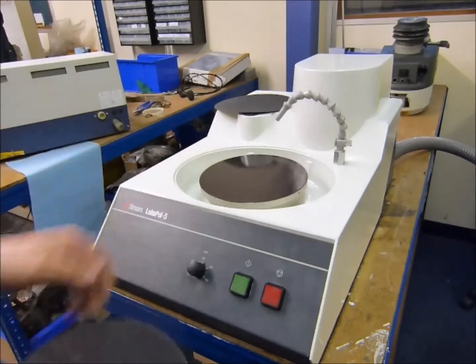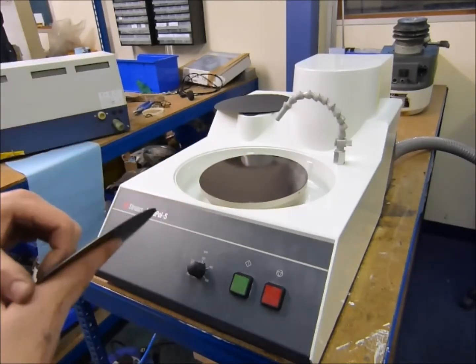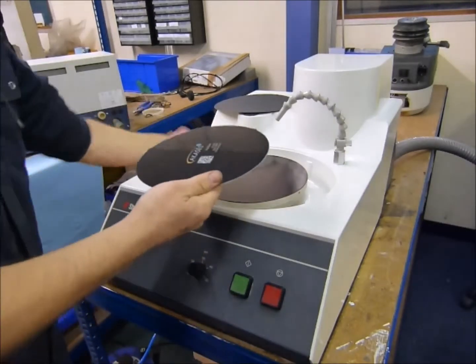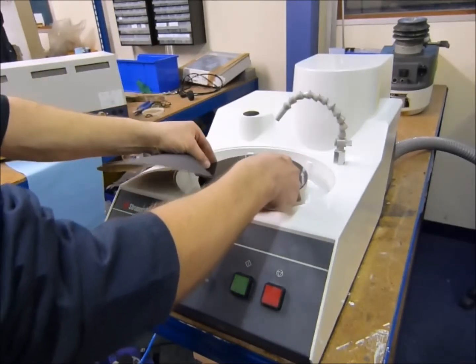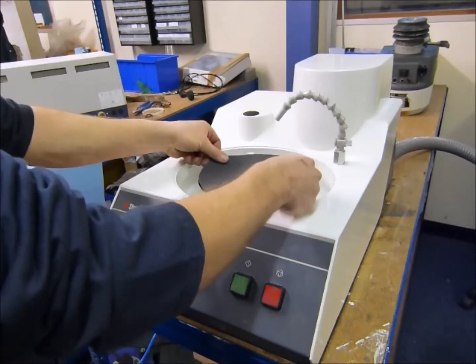Apply the Gritfix system — place the magnet on the platen, stick your magnet on, just peel back, place the steel plate onto your magnet and then apply your grinding paper.